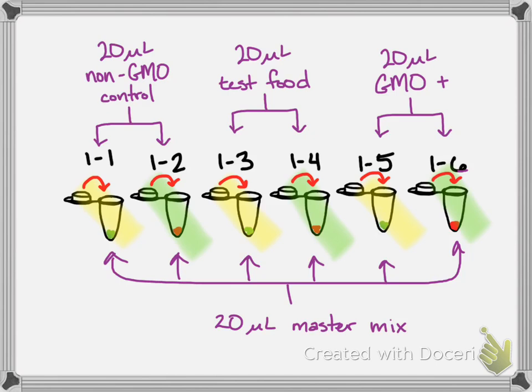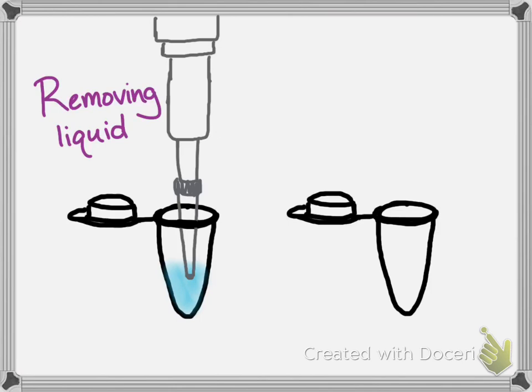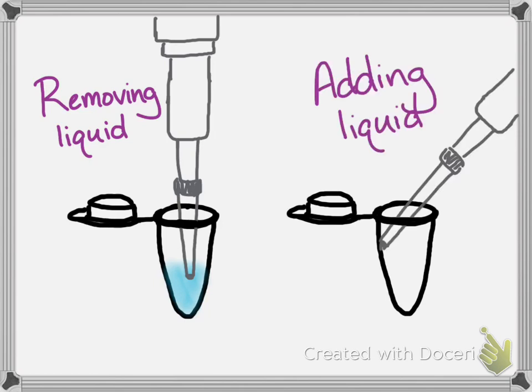But here's just a little bit of background on how removing liquid and adding liquid to these tiny tubes goes. So when you're removing liquid, your micropipette is straight up and down, and the tip is not touching the bottom of the vial necessarily. Ideally, it would be hovering below the surface of the liquid, but not quite touching the bottom. When you go to add liquid, you actually touch the pipette tip to the side of the PCR tube or the microcentrifuge tube, and that gets you optimal removal of the liquid from the pipette tip. So that's at an angle, touching the side. So those are just a couple of tricks to make your micropipetting go a little bit smoother.